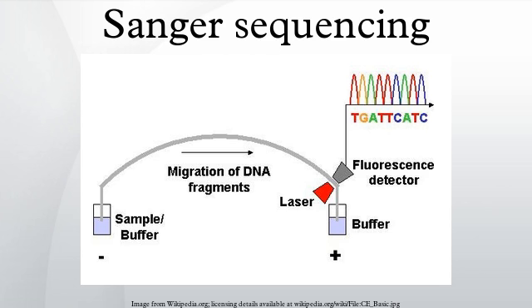Following rounds of template DNA extension from the bound primer, the resulting DNA fragments are heat denatured and separated by size using gel electrophoresis. In the original publication of 1977, the formation of base-paired loops of ssDNA was a cause of serious difficulty in resolving bands at some locations. This is frequently performed using a denaturing polyacrylamide-urea gel with each of the 4 reactions run in one of 4 individual lanes. The DNA bands may then be visualized by autoradiography or UV light, and the DNA sequence can be directly read off the X-ray film or gel image.